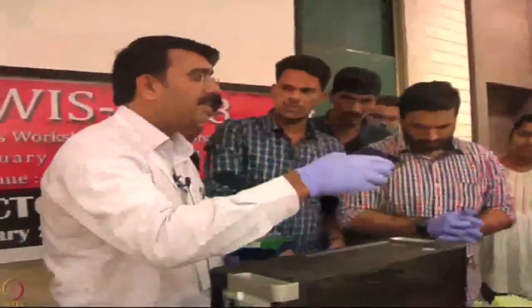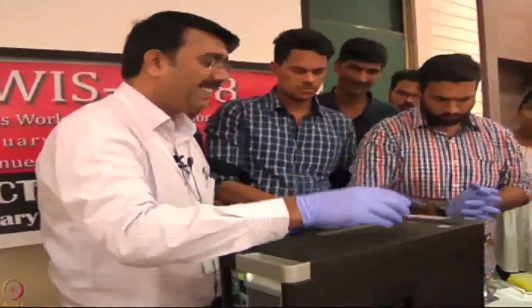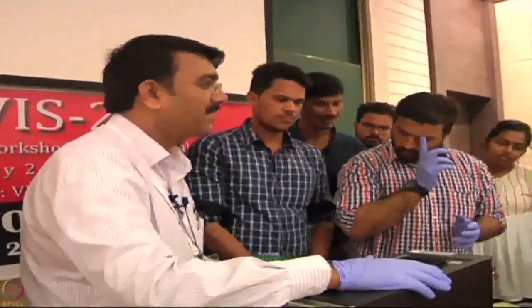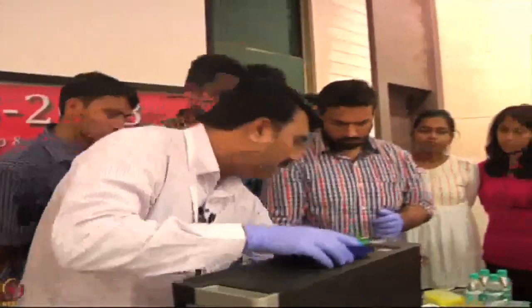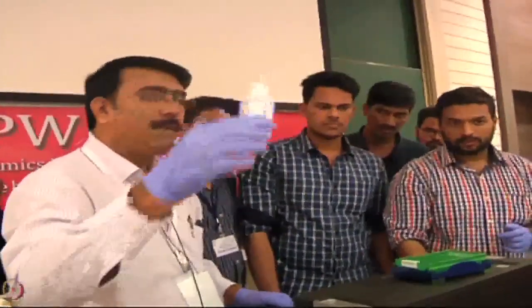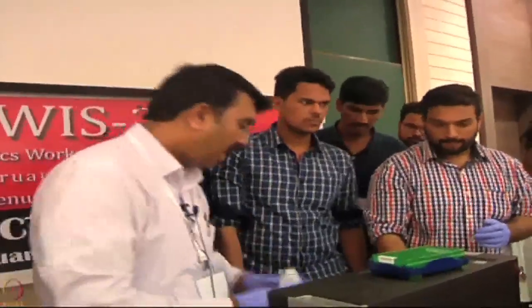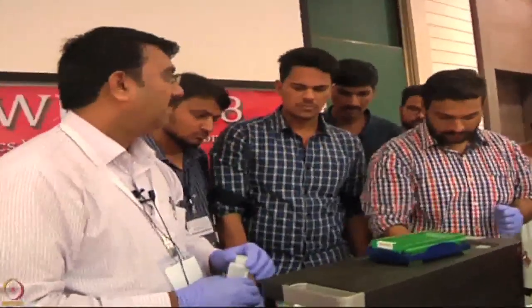Well capacity is 390 microliters, but the minimum dipping volume we are working with is 200. So here we have an SD buffer, the sample diluent buffer. It consists of PBS pH 7.4 and Tween as well as BSA. So add a liquid 200 microliter in all the wells. First well.